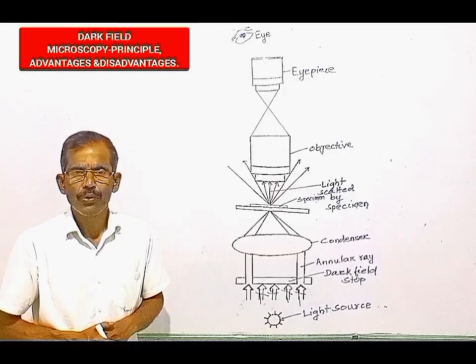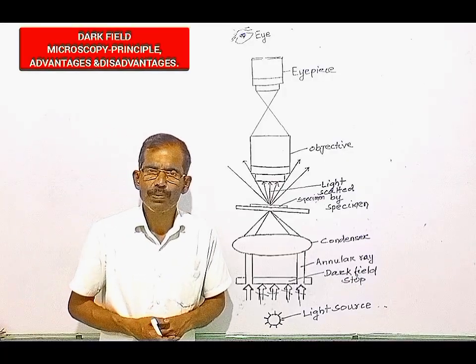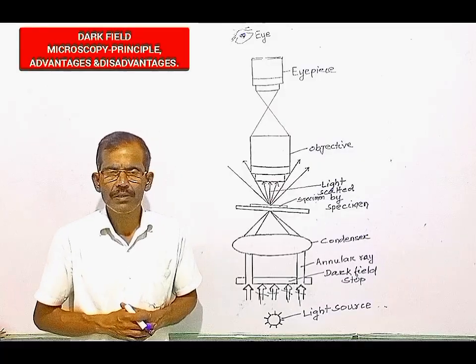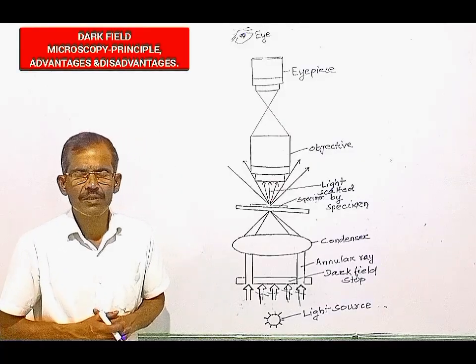Friends, today we will discuss the principle of dark field microscopy, its advantages and disadvantages.